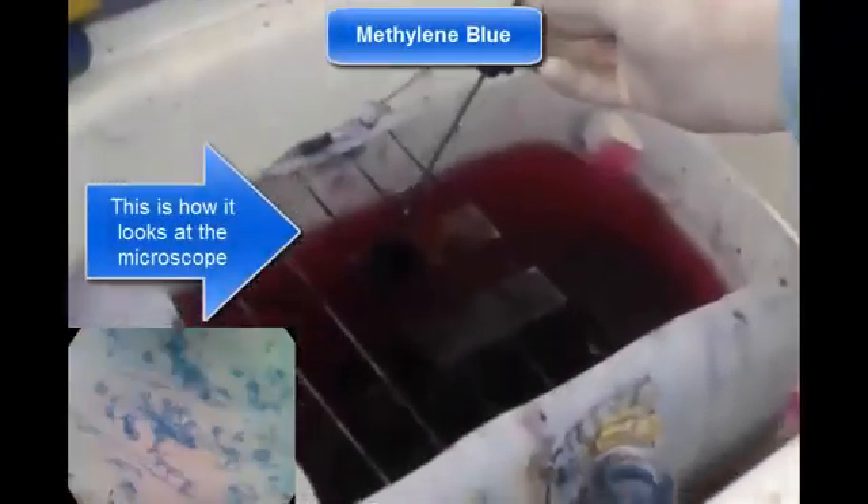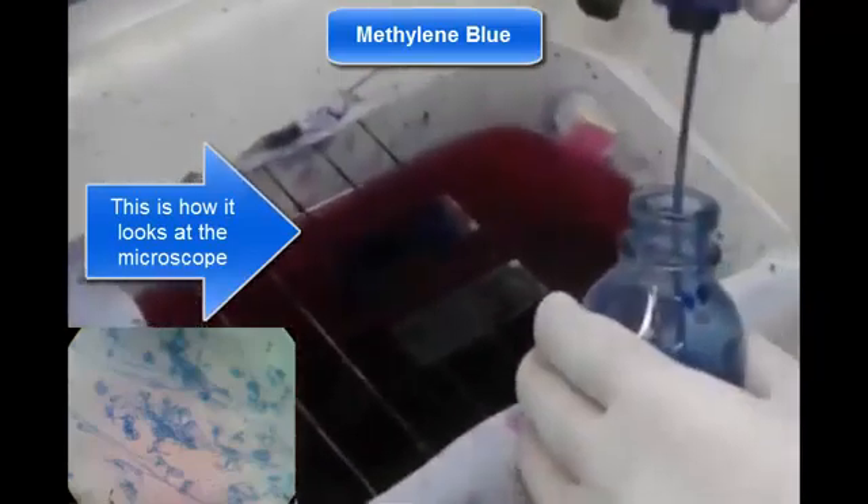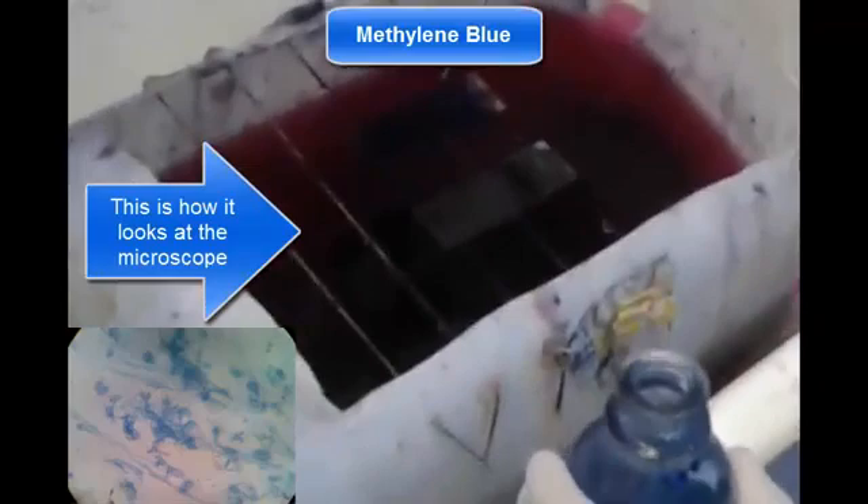Now we will cover the slide's surface with methylene blue and allow it to stain for one and a half minutes. Then we will wash it as well and set the slide to dry.